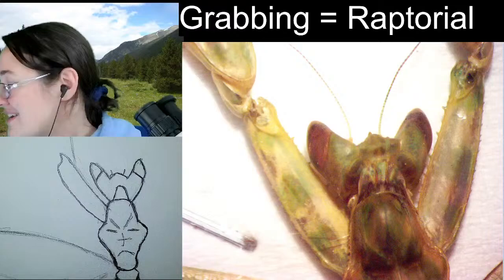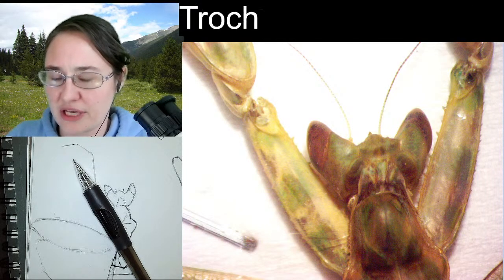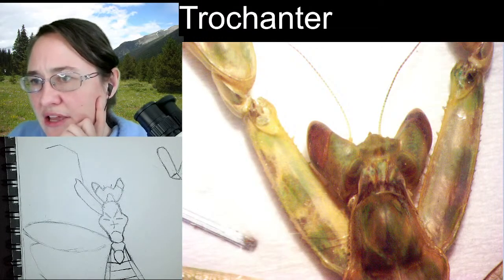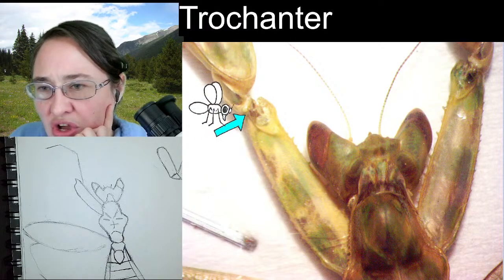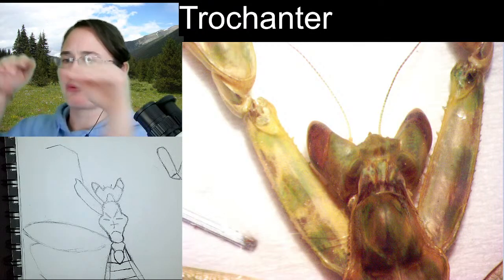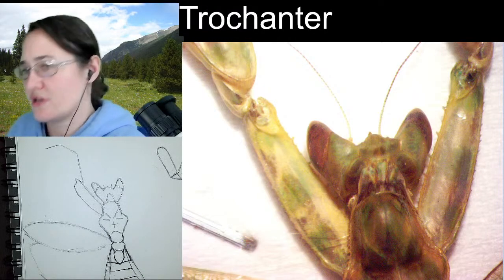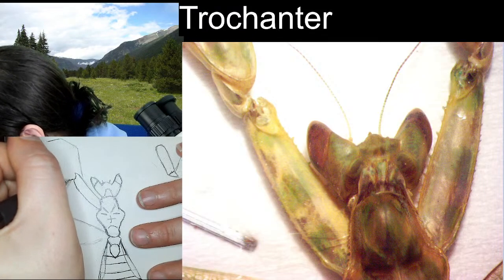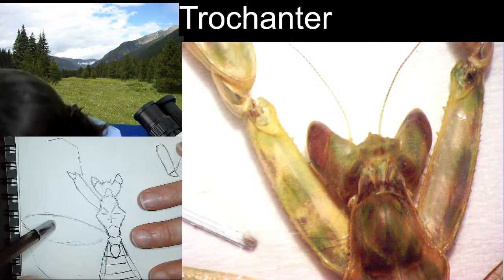Now, the trochanter, let me spell that out because we don't see the word trochanter very regularly. The trochanter is this little triangular shape. It's not as much pizza at this angle, but it's here. This little segment right here that's wide at the bottom, pointed at the top, is the segment that helps the femur really bend, right? It helps it do this. It's this part here, the trochanter. So, kind of wide at the base, like snow on the beach.